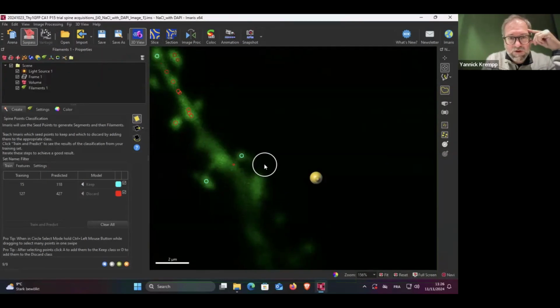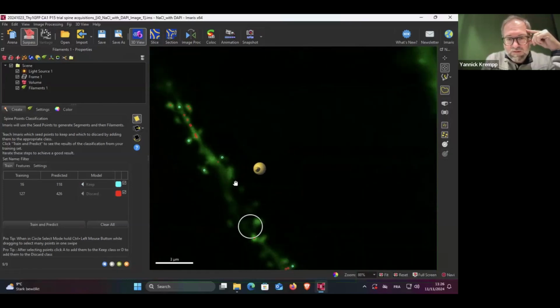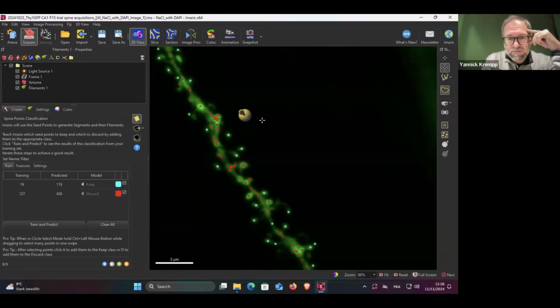So let's train and predict again. As you can see here now, it's trying to eliminate too many of them. So that's often the issue. It's difficult to find a sweet spot.